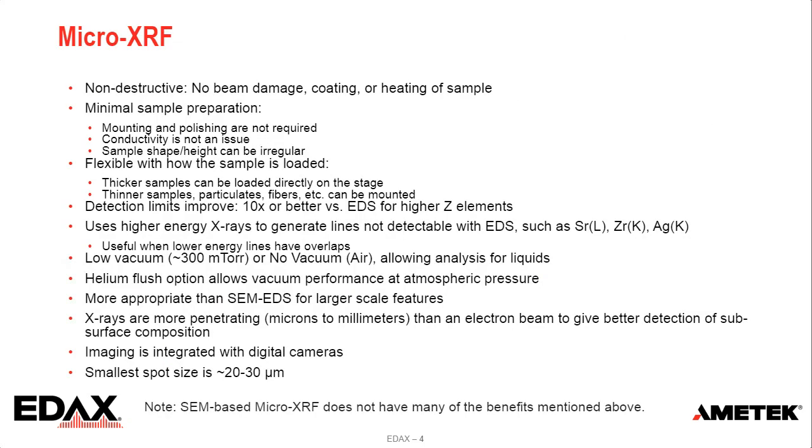For Micro-XRF, this is a non-destructive technique. There is no beam damage, and coating is not required, so you can analyze a non-conductive sample as is, and there is no heating of the sample because there is no electron beam sample interaction.